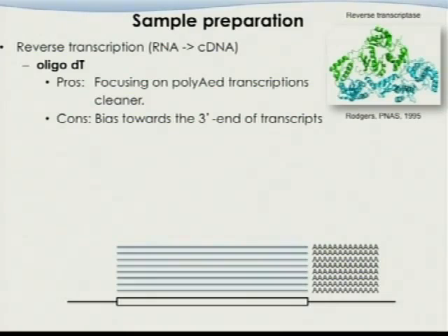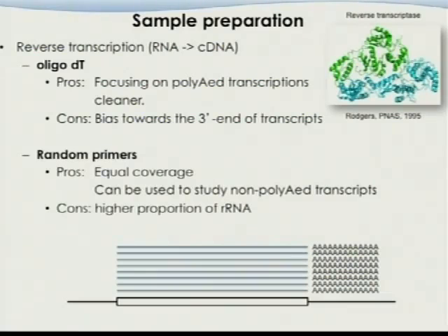Especially for some genes that have alternative promoters, meaning their starting sites are different. And one of your experimental goals is to see which promoter they use. But towards the beginning of the gene, the further it is away from the poly A, the less signal is observed, and that really interferes with your conclusions, and that can be annoying.